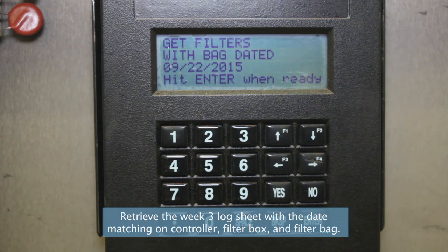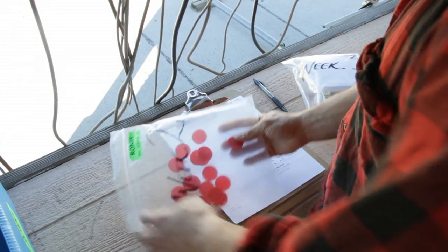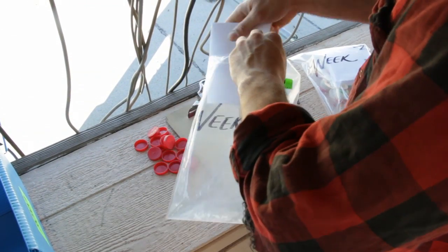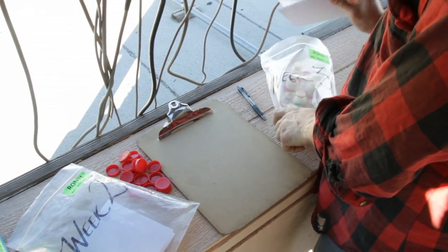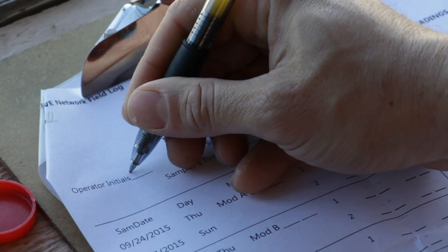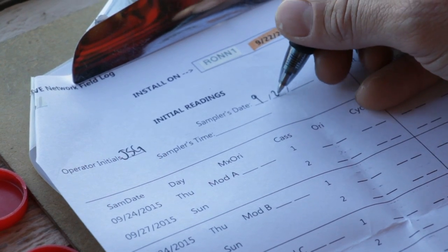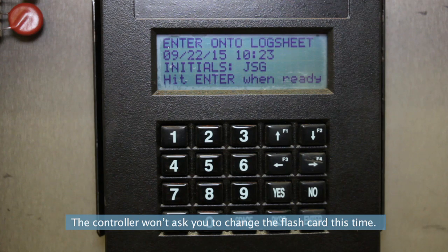Retrieve the week 3 log sheet with the date matching on the controller, filter box, and filter bag. Write down your initials and the current date and time. The controller won't ask you to change the flash card this time.